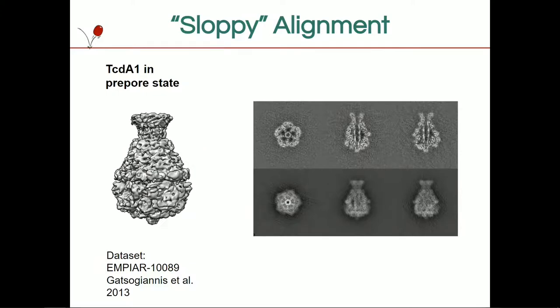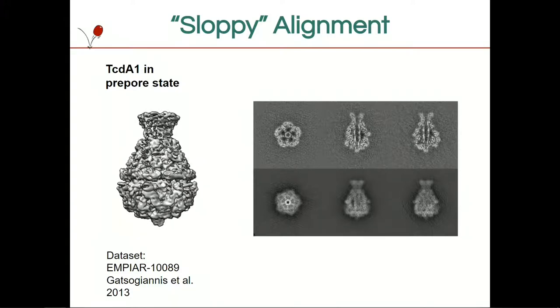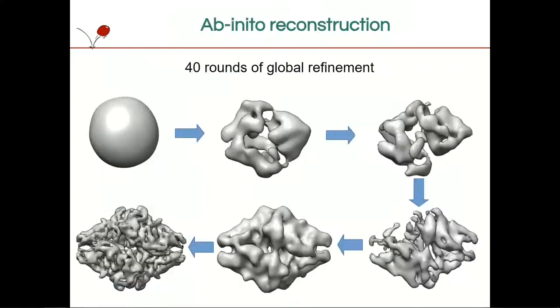It turns out this is key in doing this iterative refinement and going from a blob to essentially the correct structure. So you go through starting from the blob where you just start with randomness, and you start to explore space where you find things that look kind of like your beta galactosidase, but a bit wrong. Normally you would get stuck in one of these, but if you do this special alignment, you improve things, you don't get stuck, and eventually you'll hit the right answer and get this nice reconstruction.